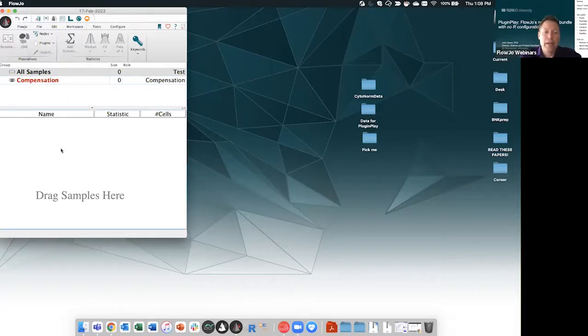So that is how plug and play works. And I don't really have a whole lot else to say, and I think that's a good thing. Download it, tell us where you put it, it's ready to go. So from here on out, for the remaining 52 minutes or so that we have left of this webinar, I'll show you what the plugins are and how to use them.